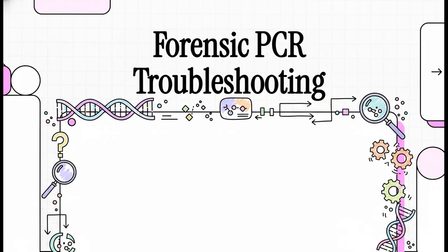When you run a forensic PCR and it fails, it's not some random event. It's actually a solvable problem. In this explainer, we're going to break down the whole process of molecular troubleshooting: how to figure out what went wrong, and more importantly, how to fix it.